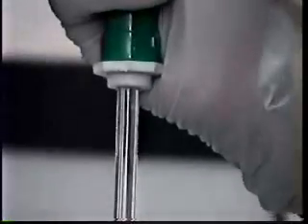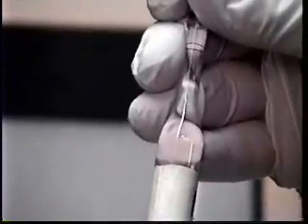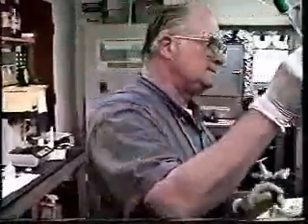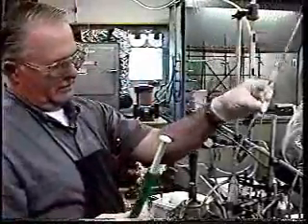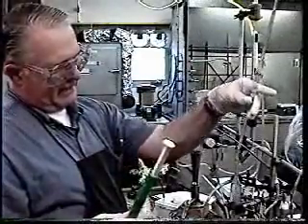...that are designed specifically to light up or glow when there's a decay of the carbon-14 atom. Now we have to make sure we wash our container completely out so the entire sample gets into our vial.